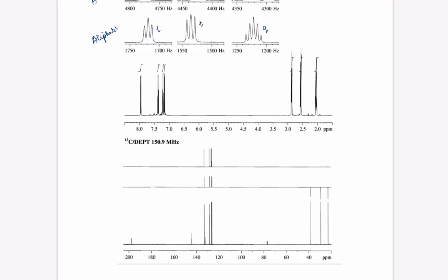So the first CH2 is actually a quintet. If it's going to be a quintet, then we can clearly see that it is sandwiched between 2 methylene carbons. So this is my CH2, which needs to appear as the quintet. And then each of these CH2s need to be counted as well. So each of these should be a triplet.